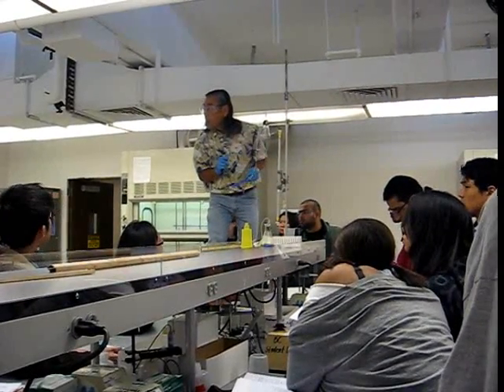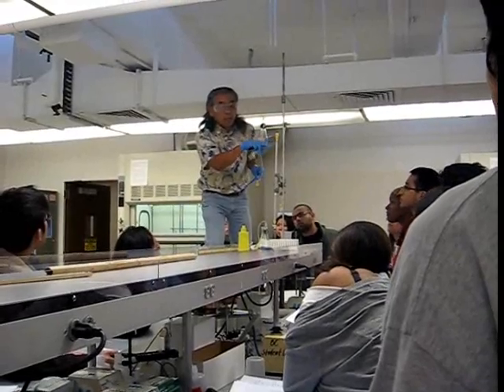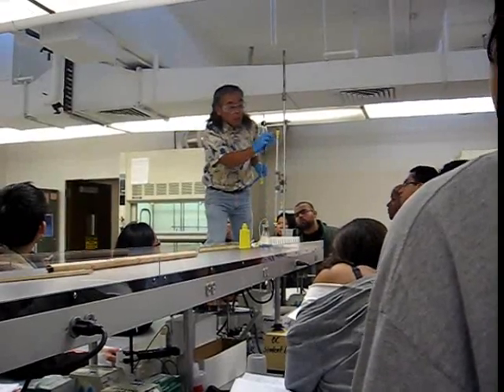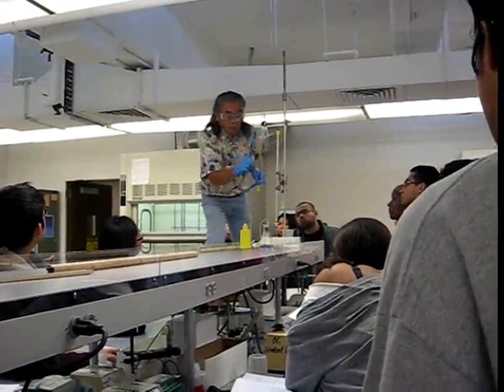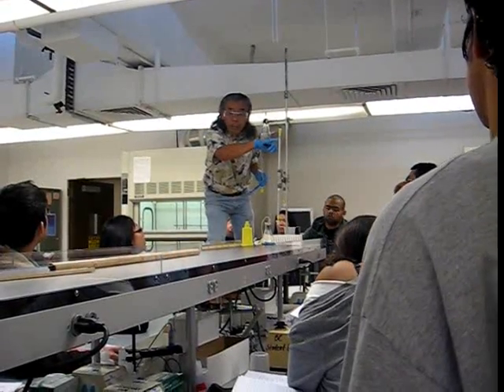Should they run their sample down into the column before they go to the top box? You should run it. When you're running your sample, this should be open — as soon as they add it. You go ahead and add it. Everything's added, then open this up. Wait until the top level, because it'll be dark, goes into the resin.